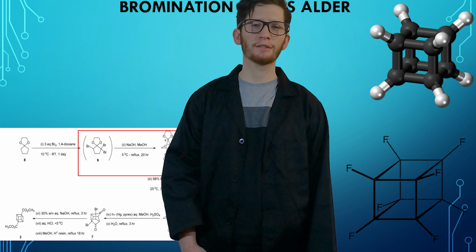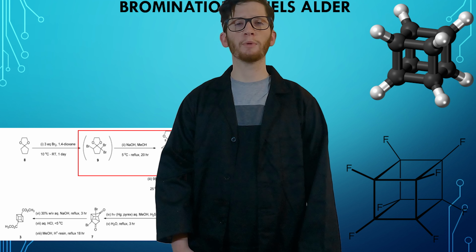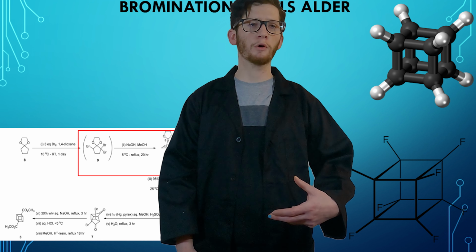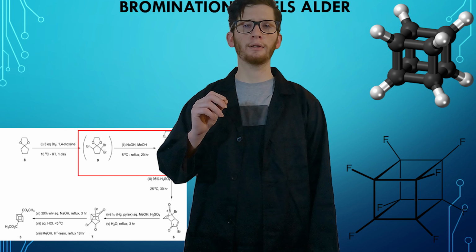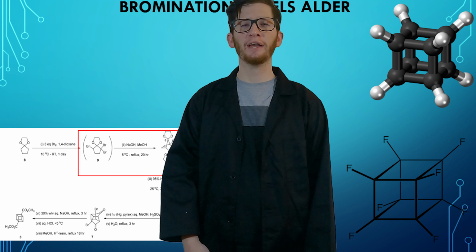It was more of a passive procedure. I was able to keep a good eye on it that whole time. So when we got to attempting to precipitate our product, that did not work very well. Basically what we got was a bunch of very, very fine particles of tar, and it actually clogged my vacuum filter, and I'm still trying to clean it out. So it was very annoying.